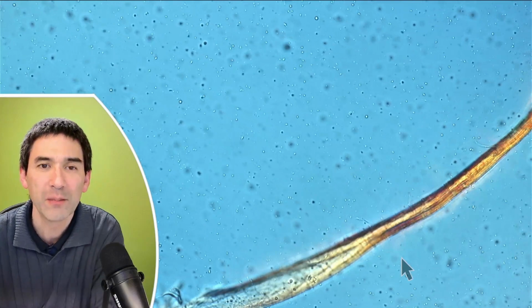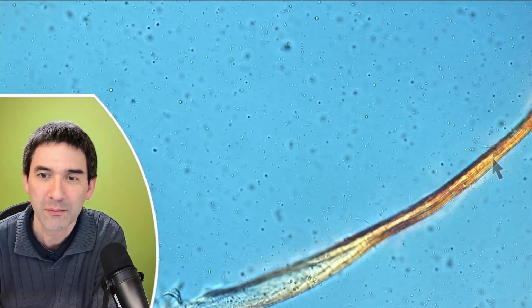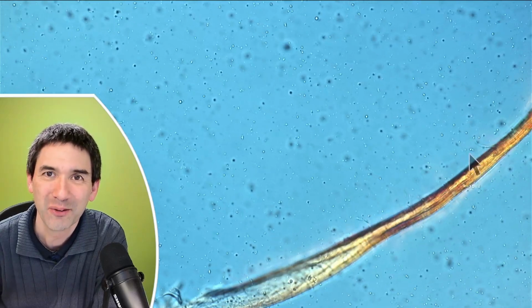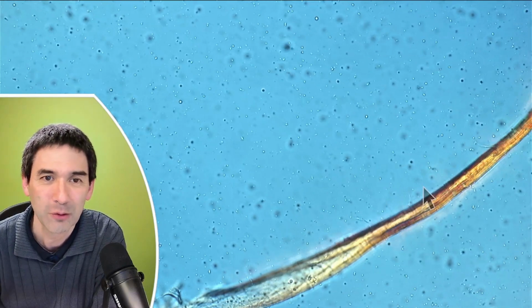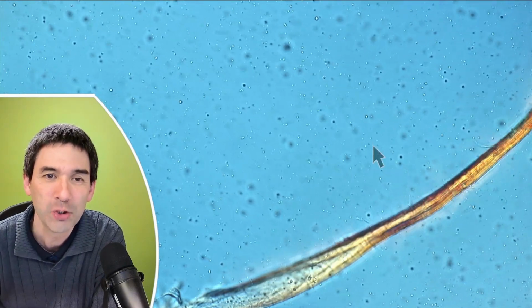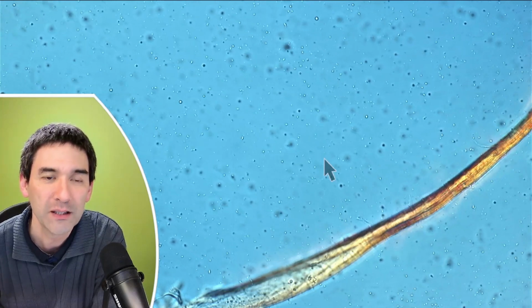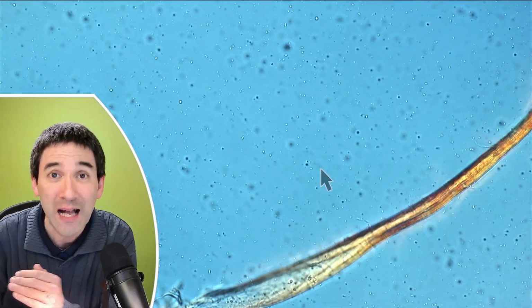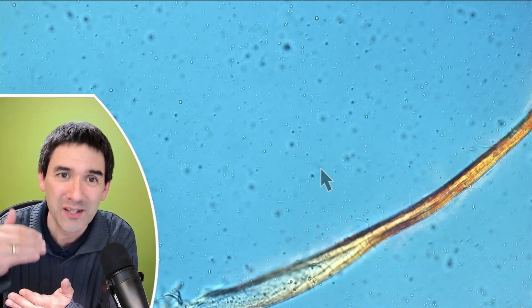So this here is now some milk, and this huge thing here, that is just a contaminant, some kind of a fiber, which happens to be on the microscope slide, because I wiped the microscope slide, so maybe it's a little bit of some cloth or some fiber from a tissue paper. But those little dots that you see here in the background, right? These are fat droplets, right? And they also vibrate, and they also seem to be streaming a little bit, because as the liquid evaporates from beneath the cover glass, this also causes this streaming motion.